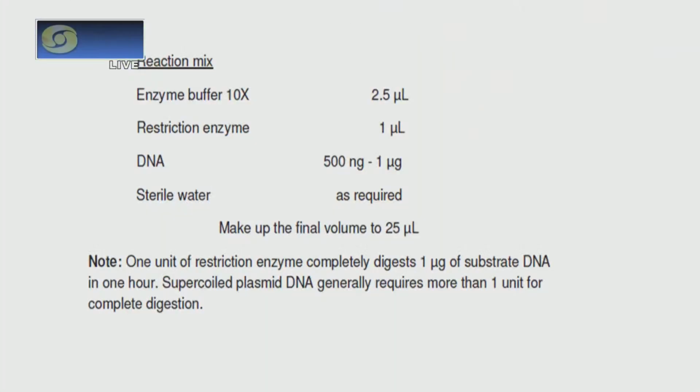It will also vary with the purpose of your experiment, purpose of your study. It depends on the copy number also sometimes. That is, if it is a low copy plasmid, then it's different. If it is a high copy, then it might differ. So there are several conditions. My main intention is to let you know how to set up a reaction, what are the components that are added, what is the temperature that you need to maintain, and how many hours you need to maintain the reaction. So that is how you set up a reaction.